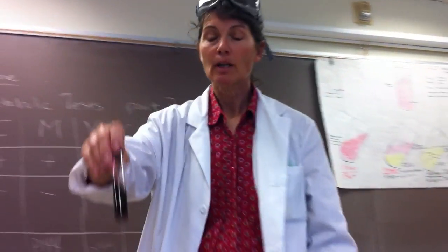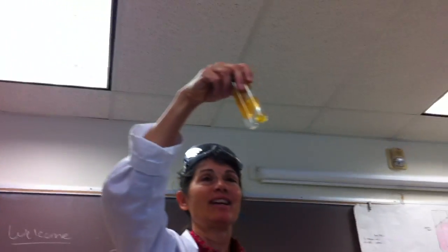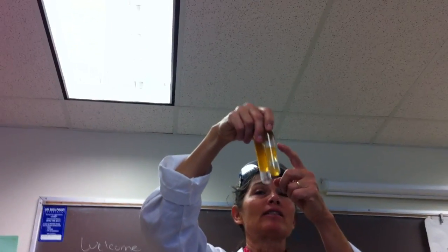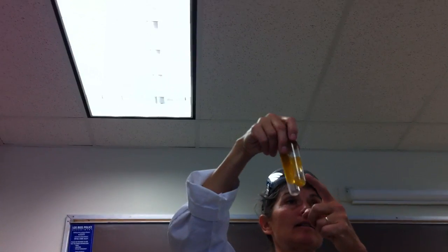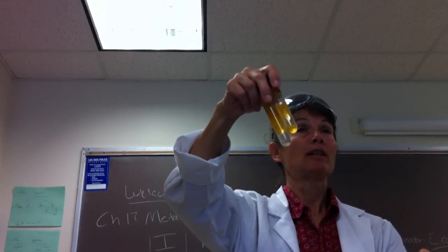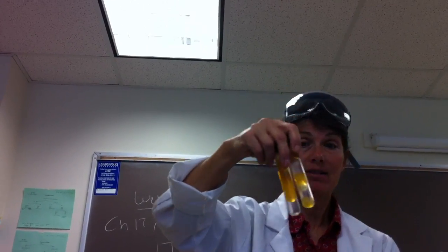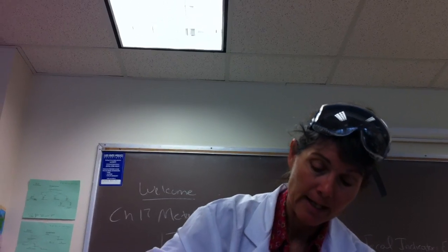All right. Now let's take a look at your E. coli. Some of you will get different results, but here are a couple of E. coli results. Did somebody do anything wrong there? Did they inoculate these incorrectly? No. That's all the gas the E. coli were making from fermentation. So you see that's a lot of gas. Let's go ahead and read these guys.